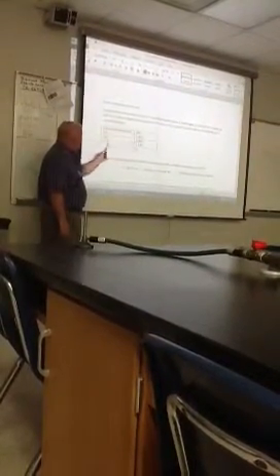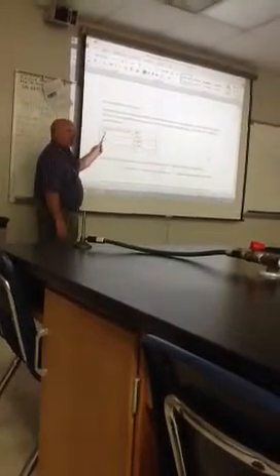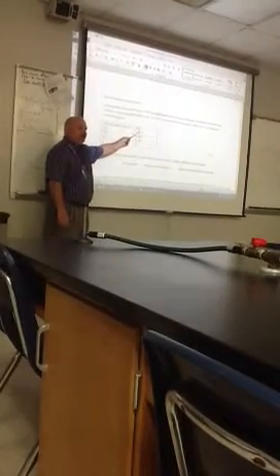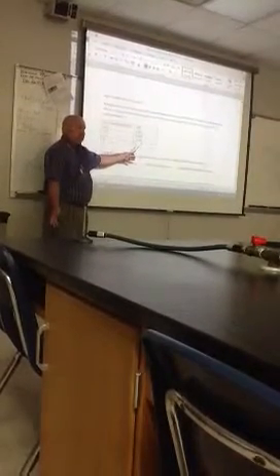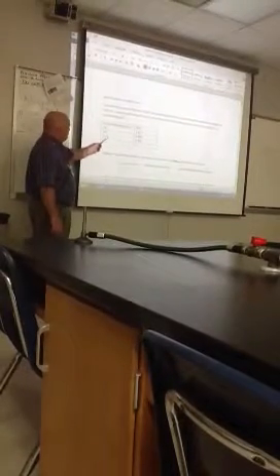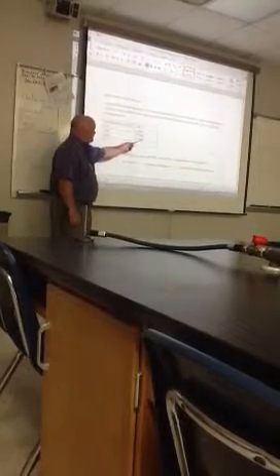Does that make sense? Well, this number is about half of that number, so it makes sense that that number is about half of that number. In other words, there's half as much stuff, so it should have absorbed half as much light. Does that make sense? Okay. Then we have a real small sample, 22.5, and it's got an absorbance of 0.185.